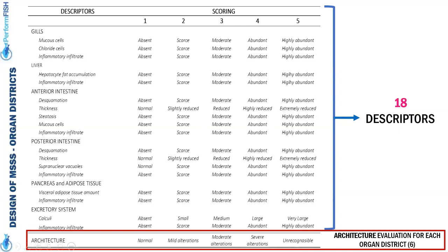And then furthermore, for each organ district, architecture is also scored.